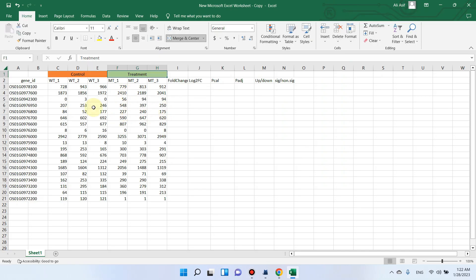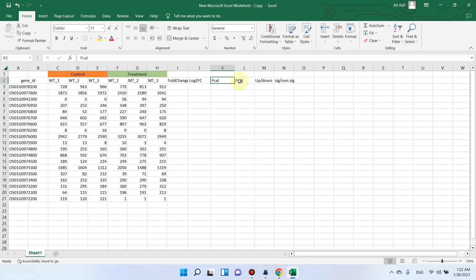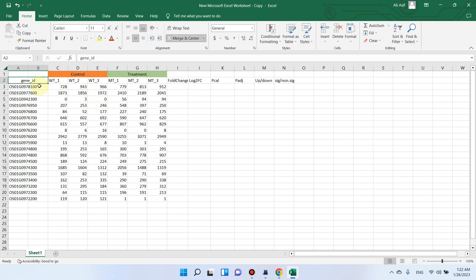Welcome to another video tutorial. In this video I will tell you how we can analyze our RNA-seq data and calculate FC value, log2 FC value, p-calculated value, then p-adjusted value, and then we will find up and down regulated genes, and finally we will find significant and non-significant genes using only this simple Excel program.